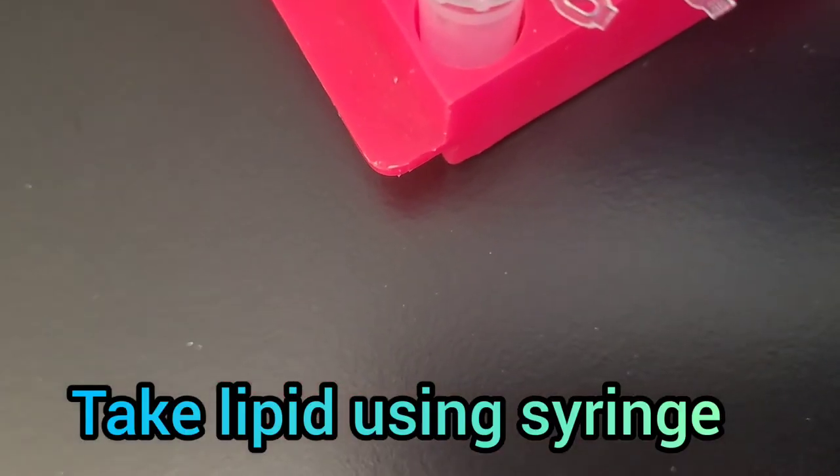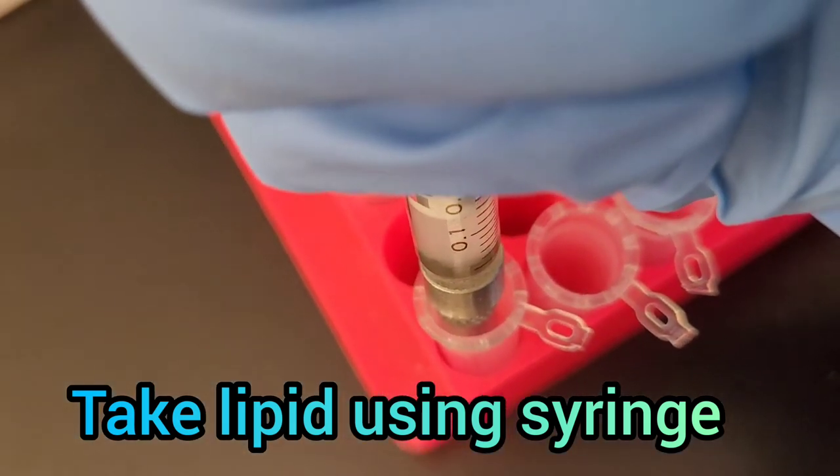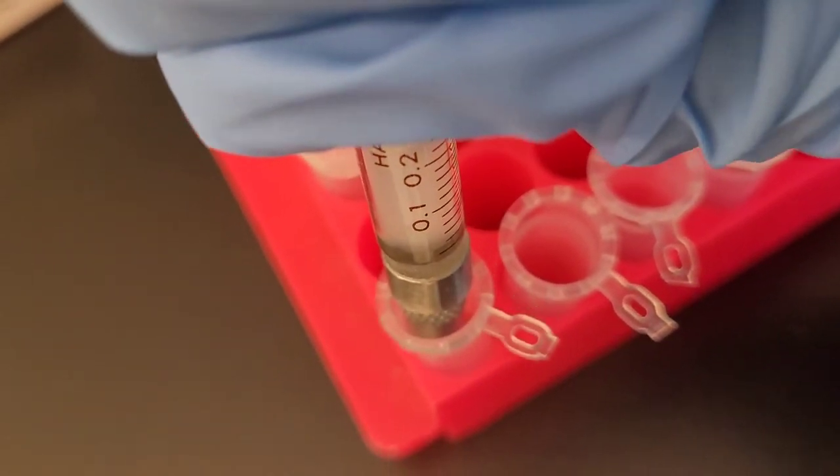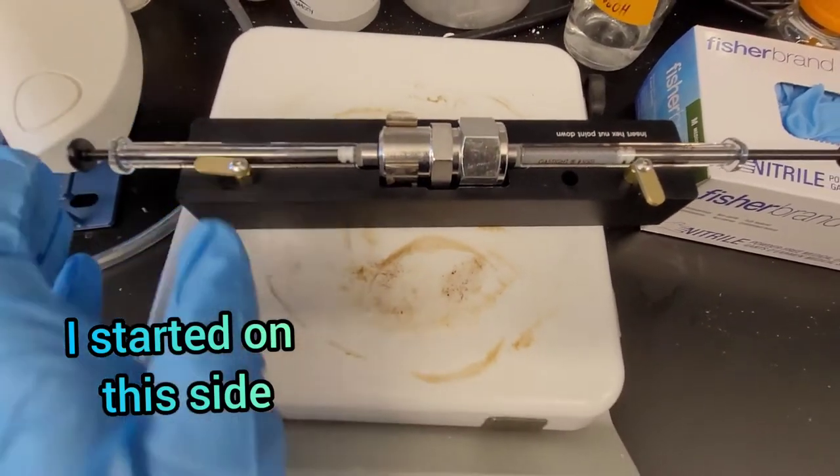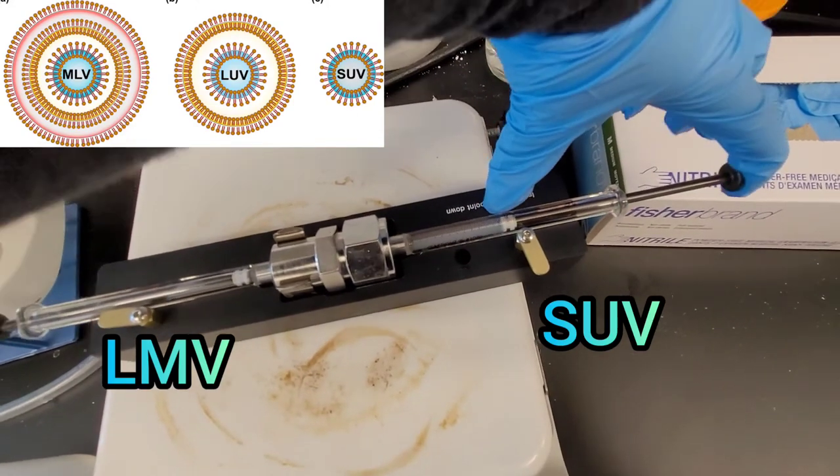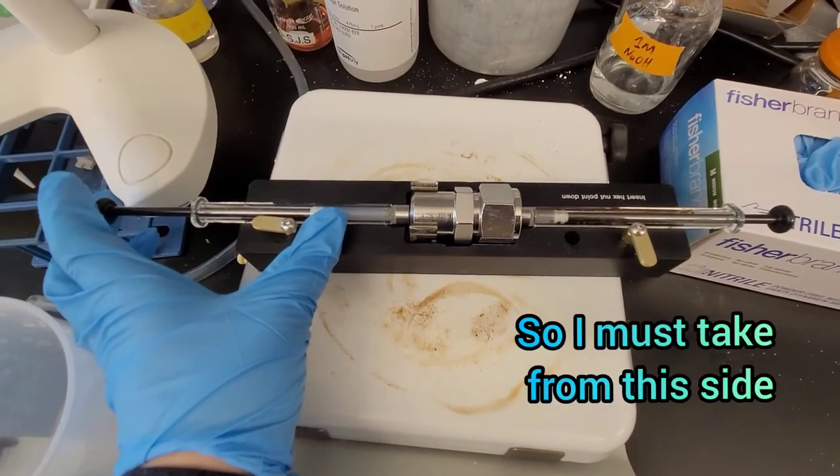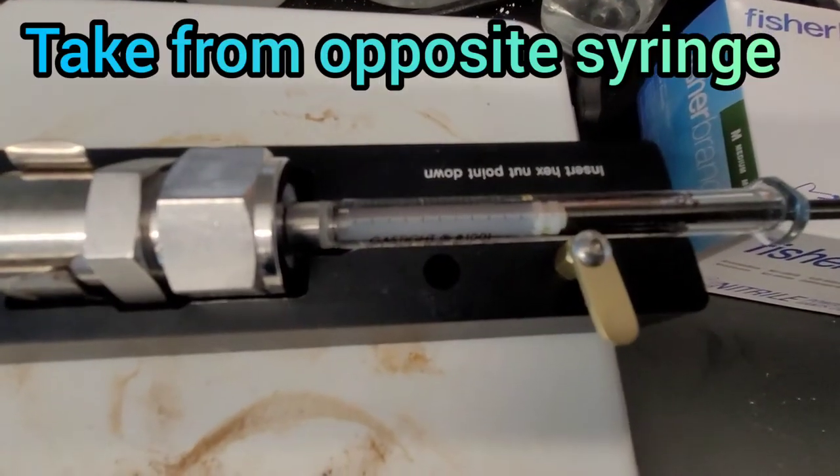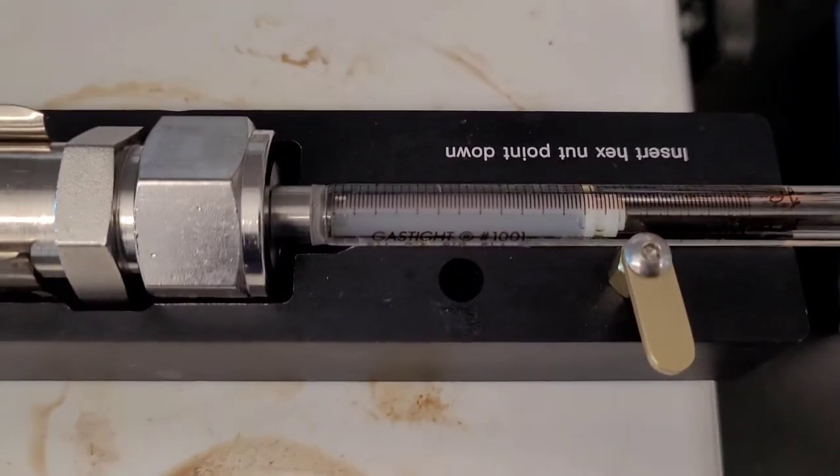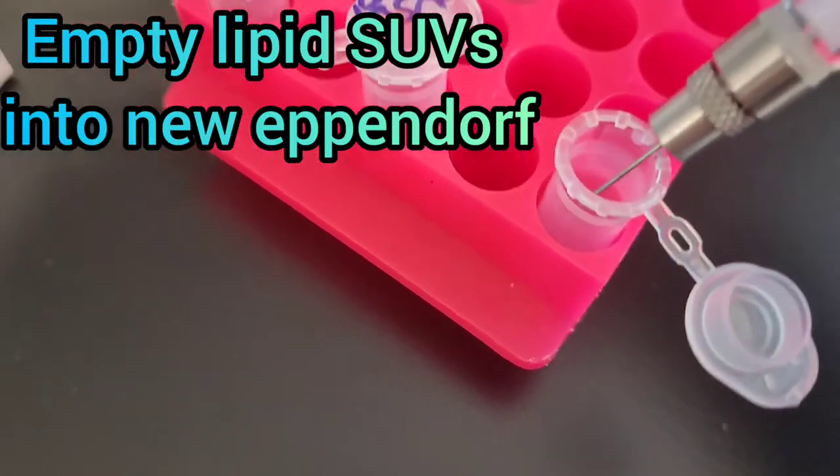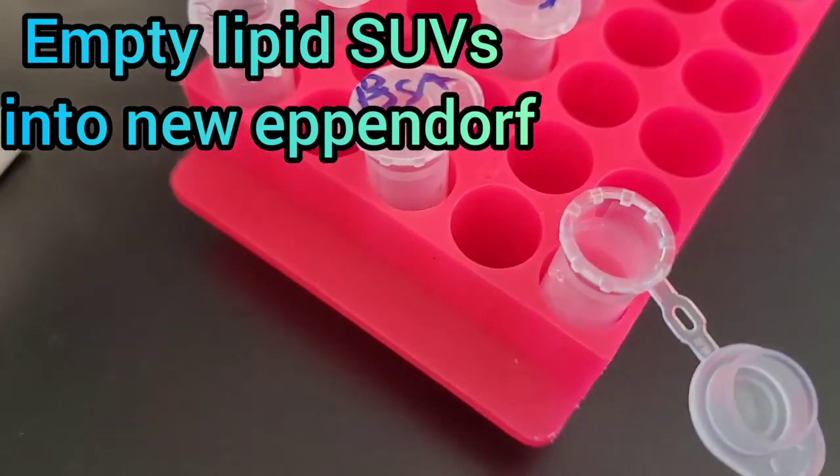Then you take in your lipid with one syringe and screw in the syringes. You have to remember which side you start from because the start side has your large multilamellar vesicles on one side of the filter, and on the other syringe you will have your small unilamellar vesicles which have passed through the filter and are smaller and better for use. Then you empty it into a new clean Eppendorf.